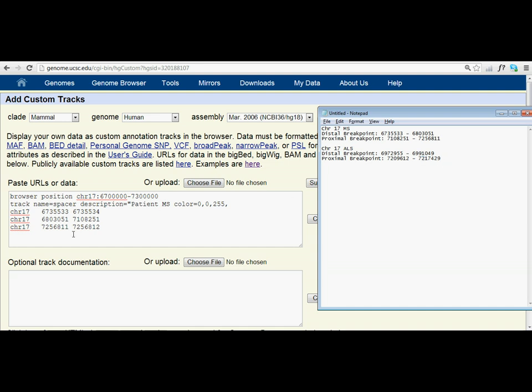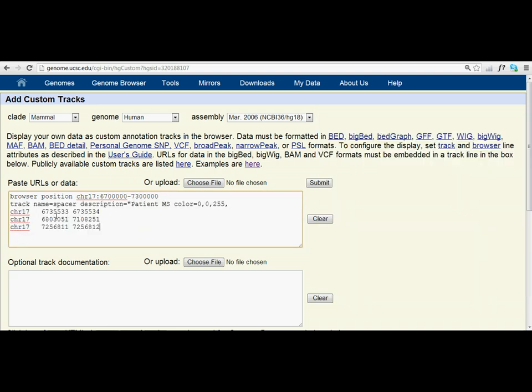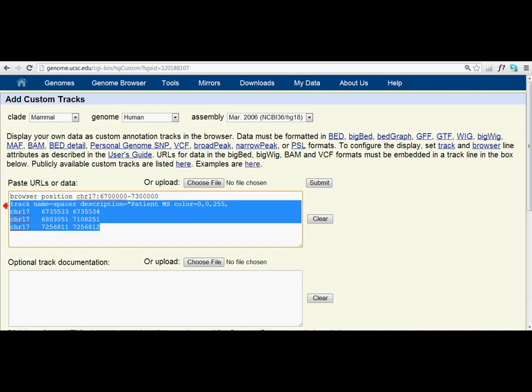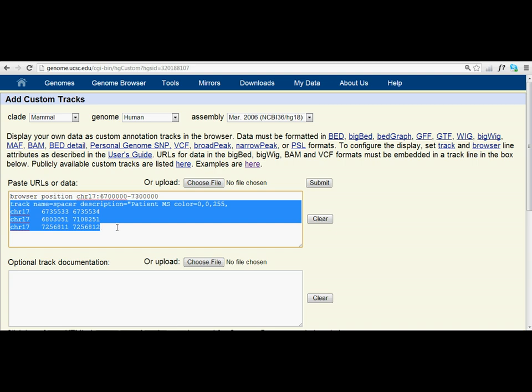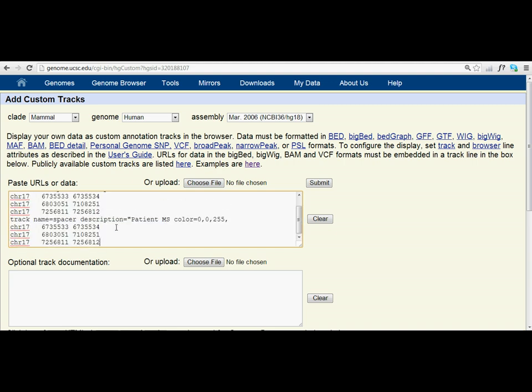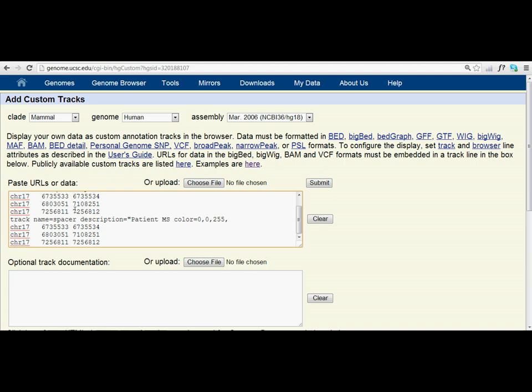So the next thing that we need to do is we need to add in the second patient. What we do is we copy - we don't copy the browser position, but everything below that from track name all the way down to here. Copy that and then we press paste. And notice that it says track name equals spacer. Instead of that, we want to make it track name equals 1 for patient 1, track name equals 2 for patient 2.